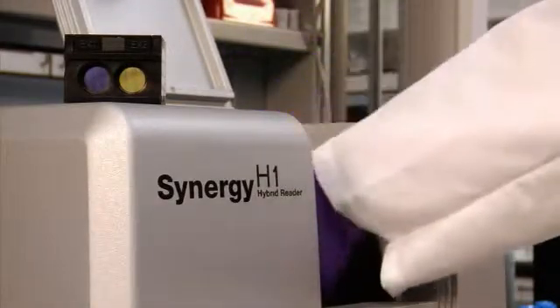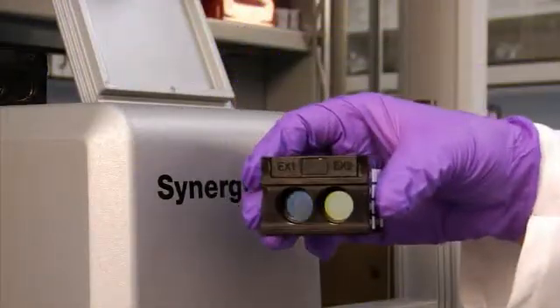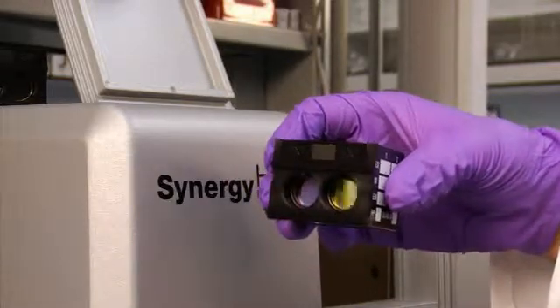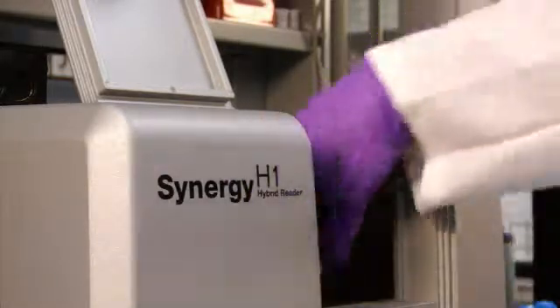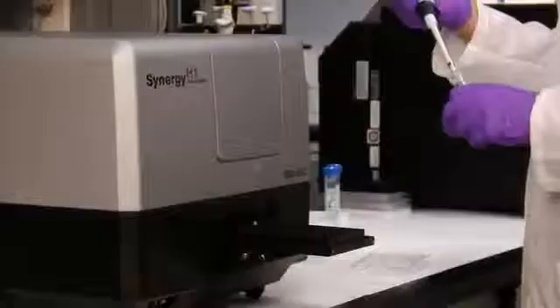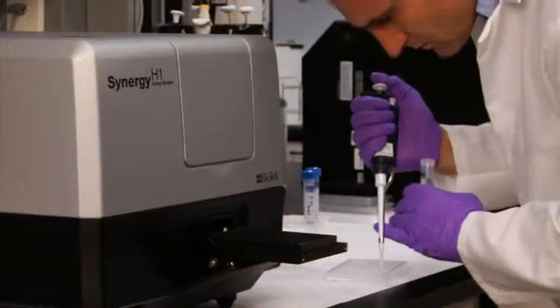The filter optics come with easy-to-use filter cubes. Each filter cube contains all the required filters and mirrors to detect specific fluorophores. The cubes are positioned using magnets and can be swapped in seconds to easily switch from one detection mode to the next.